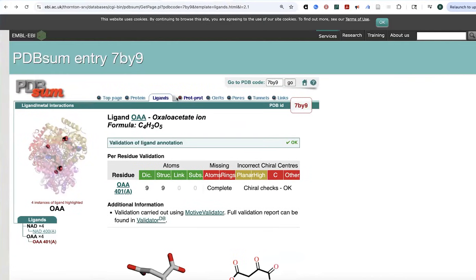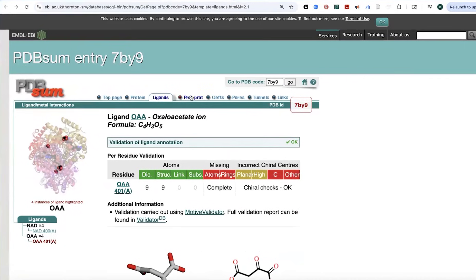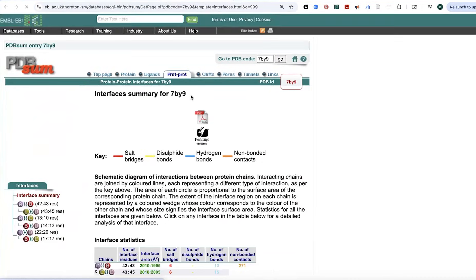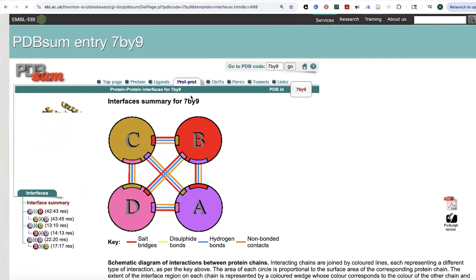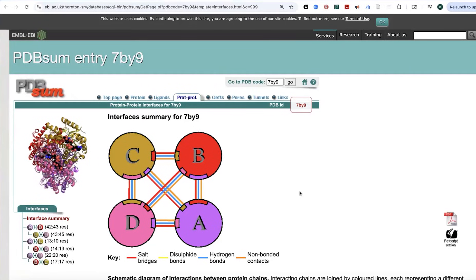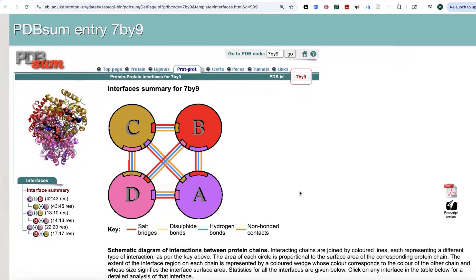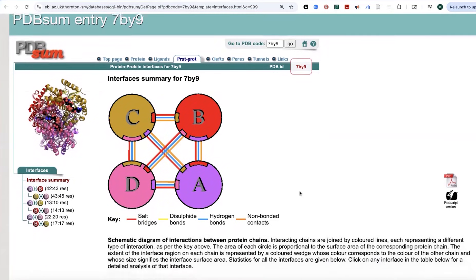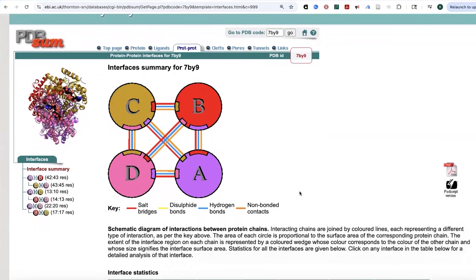That's to the ligand, but you can do similar things between the different protein subunits. That was for the ligands, but you can do similar things between the protein subunits if you have an oligomeric protein where you have multiple subunits, multiple chains. In this case, we have a homotetramer, so there are four identical chains, but they're going to have different interfaces.